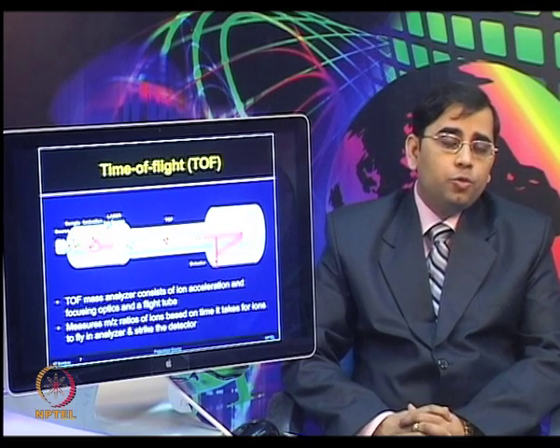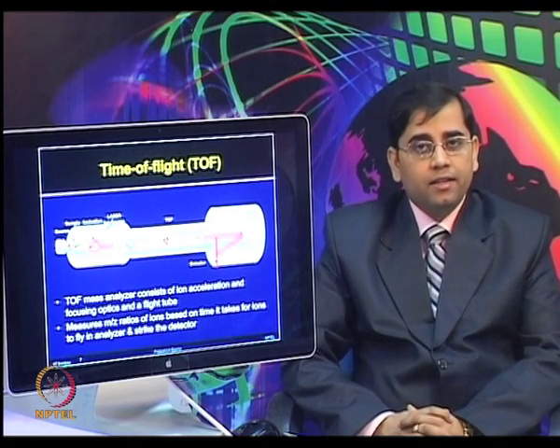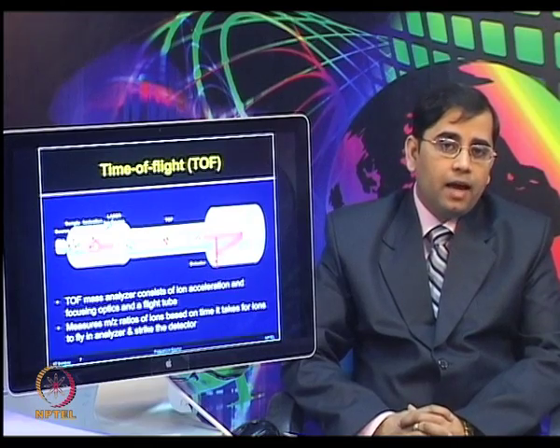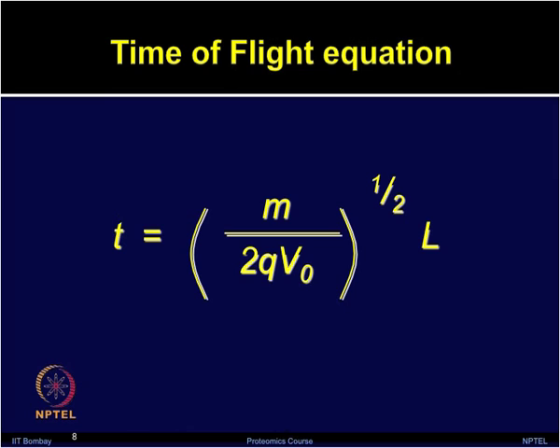Now, time of flight analyzers often outperform scanning mass analyzers in sensitivity and scan speed. The time of flight of a charged ion can be calculated by using the equation shown in this slide.